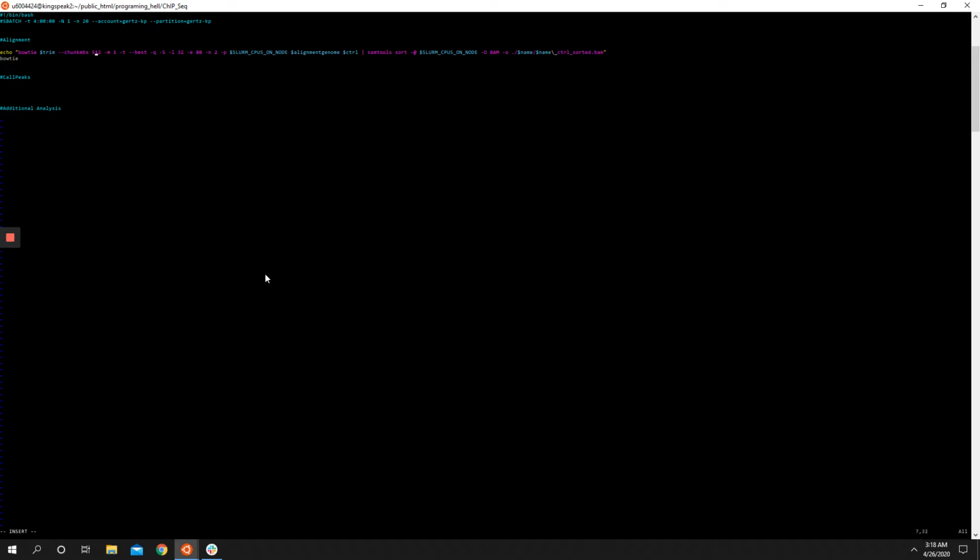This is basically telling the program what inputs you're giving it. You could make a program without flags, but this is just to make it easy so that people can optionally put in some input and not others, and also put it in any order they want, as long as they've got the right flag in front.